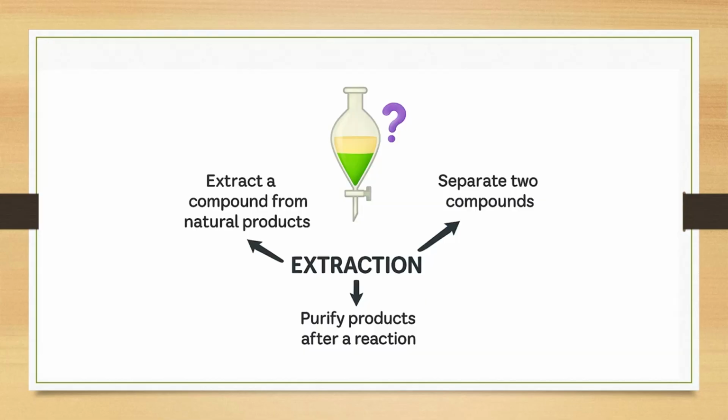This principle is not limited to caffeine. Extraction is one of chemistry's most versatile tools. It is sometimes called chemistry's Swiss Army knife. We use it to isolate natural compounds from plants, to purify the products of a reaction, to remove unwanted starting materials, and to obtain pure substances for medicines, foods, and flavorings. Many industries rely heavily on extraction as the very first step to obtaining a clean compound.